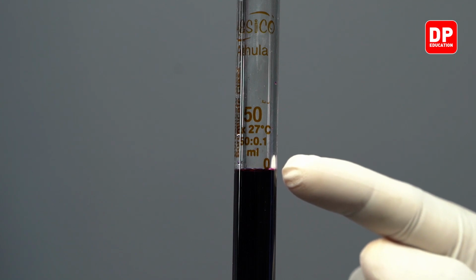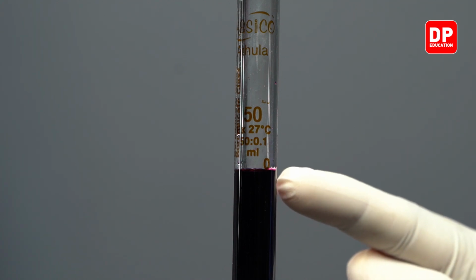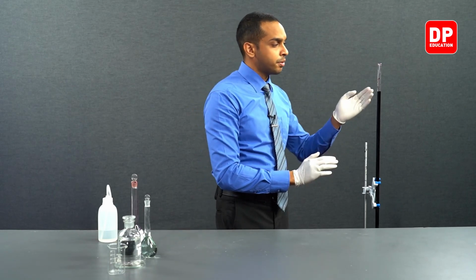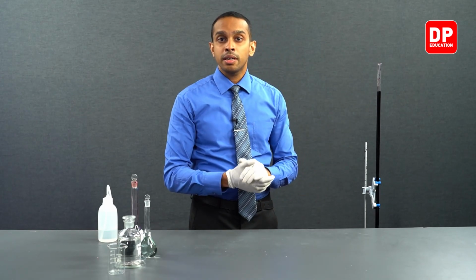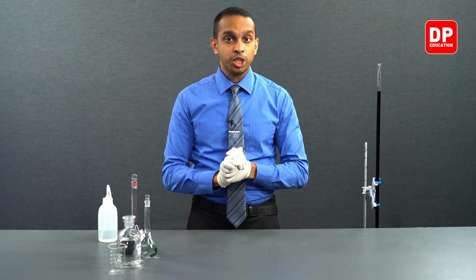The zero line is over here. I'm not sure whether the camera can capture the meniscus, but the meniscus is aligning with the zero line that is present in the burette. Right. So now I have removed some solution and made sure the meniscus of the solution is perfectly aligning with the zero line of the burette. With that, we have finished.